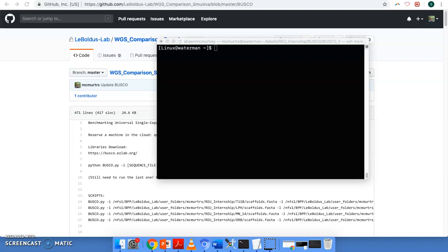Hi everyone. In this video we're going to be going over how to run our genome sequence through a program called BUSCO, which stands for Benchmarking Universal Single Copy Orthologues. It's a way to get quantitative measures of how complete our genome is compared to different data sets that they have.